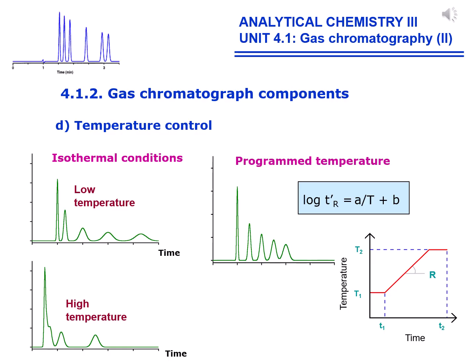The equation describing the dependence of the retention time with temperature is shown in the blue box, where uppercase T is the temperature in Kelvin and lowercase t is time in minutes. The important point in this equation is that temperature and retention time are inversely proportional.